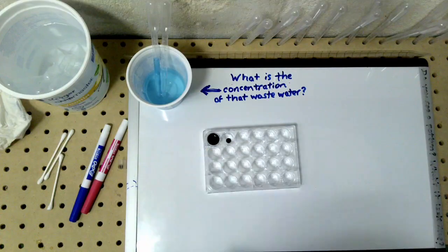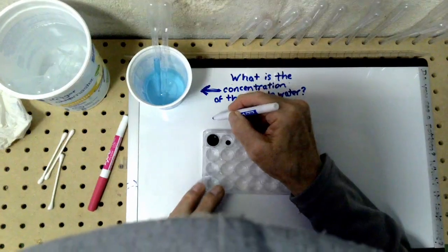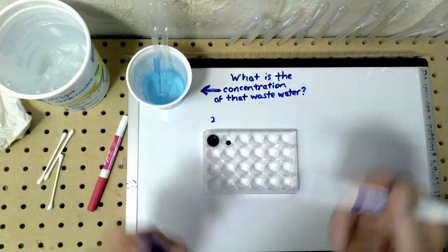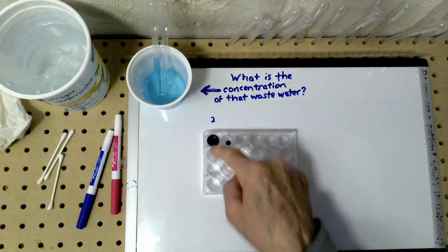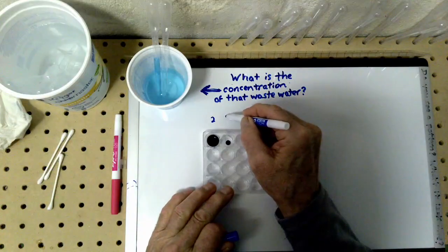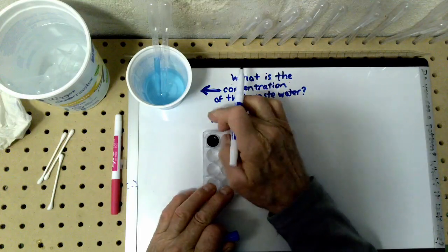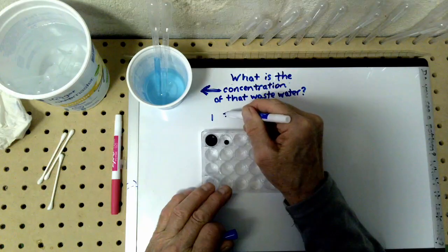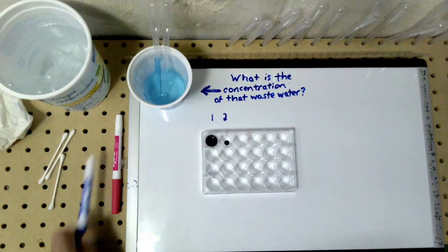Okay. Now what am I going to do? And I can label that. I'll just put a 2 right there. The times 1 I've already messed up, because the times 1 was the original drop. Okay, so we're good with that. Now let's go 10 to the 3. That's a 10. Hold on. That's 10 to the, what is that? That's times 10. Whoops. That's times 10. This is going to be times 10 raised to the second power, I think. Hold on. I got that right? Yes. Okay. Ahead of myself here.